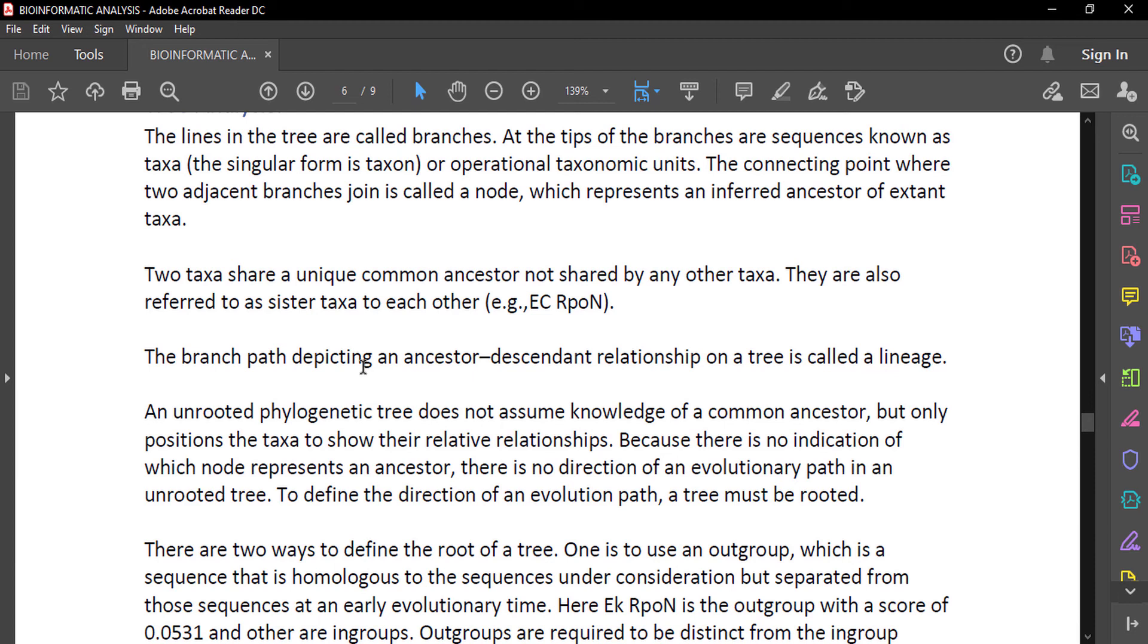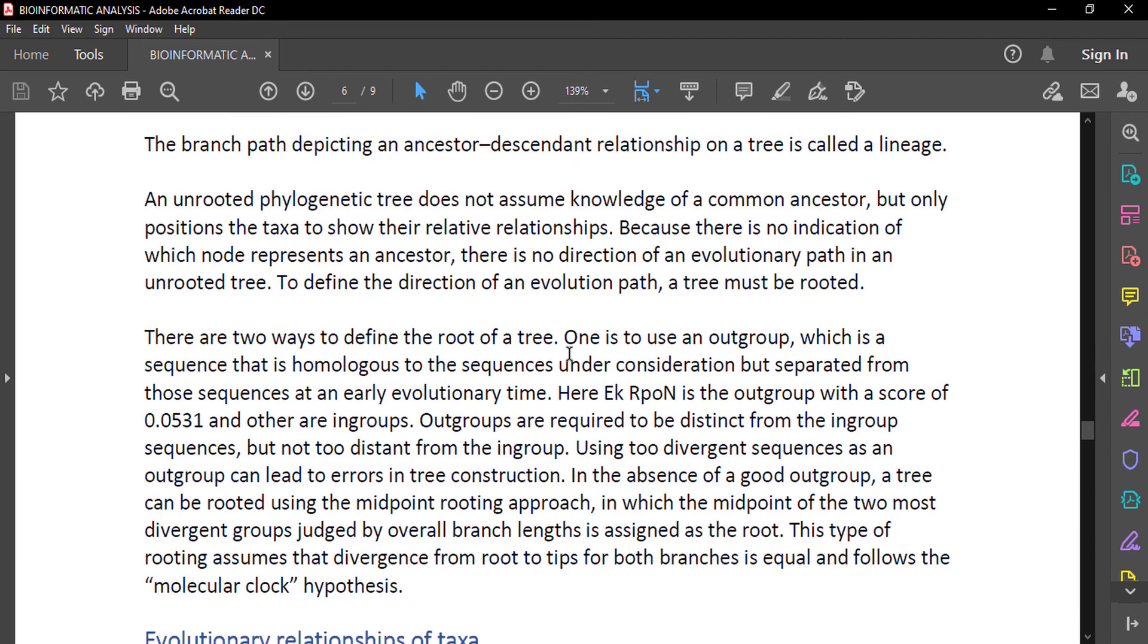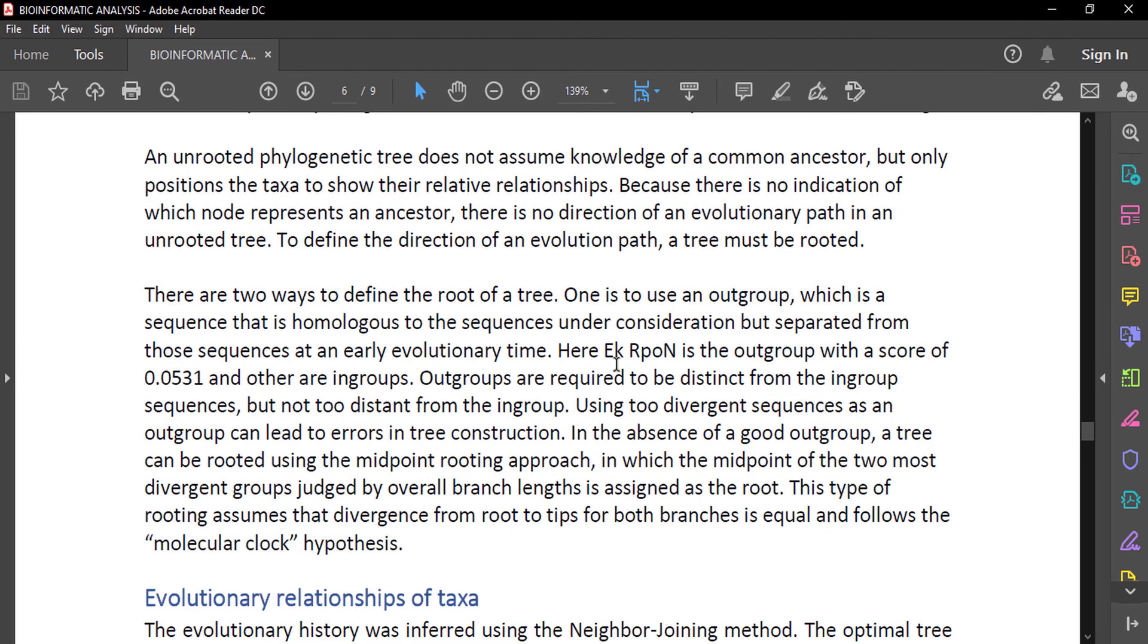To define the direction of an evolutionary path, a tree must be rooted. There are two ways to define the root of a tree. One is to use an outgroup that we have talked about, which is a sequence that is homologous to the sequences under consideration but separated from those sequences at an early evolutionary time. Here, EKRPON is the outgroup with a score of 0.0531, and others are ingroups.